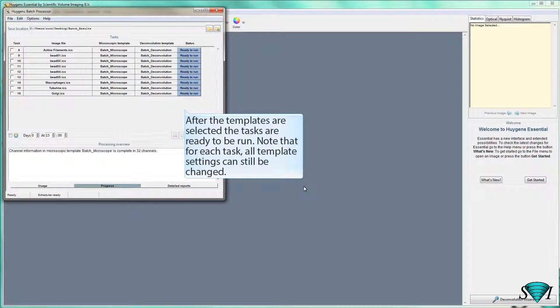After the templates are selected, the tasks are ready to be run. Note that for each task, all template settings can still be changed.